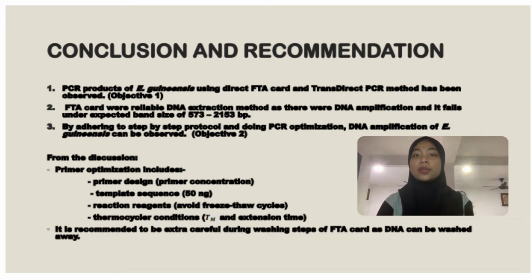It is recommended to be extra careful during washing steps of FTA card as DNA can be washed away and reduce DNA concentration needed. And this concludes my FYP project.